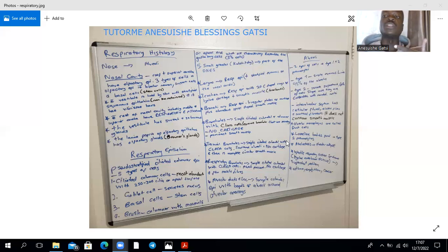It's from those squamous cells that arise as a result of the metaplasia, right? And it's due to subjecting our respiratory epithelium to stress. If we subject our respiratory epithelium to stress, it's going to change in such a way to become an epithelium which is adapted to the ensuing stress.